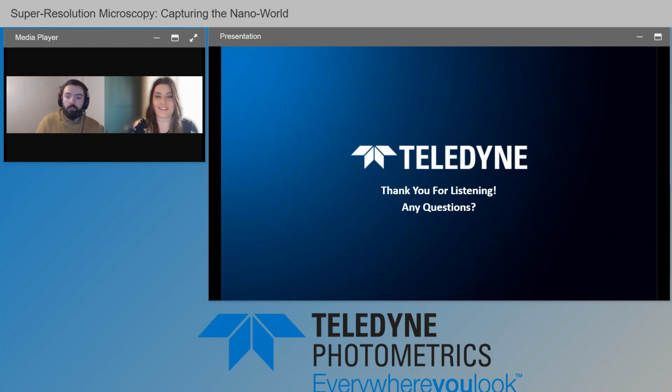Of course. Okay. The major role of transmission electron microscopy and super resolution microscopy is both or not? If both, why do we need super resolution microscopy?